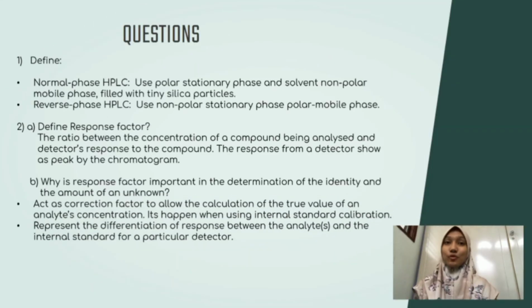There are some questionnaire and pre-lab questions regarding our experiment, high-performance liquid chromatography. Firstly, define the normal phase of HPLC: it uses a polar stationary phase and a non-polar mobile phase, filled with tiny silica particles. However, reverse phase HPLC uses a non-polar stationary phase and a polar mobile phase. Second, define the response factor: it is the ratio between the concentration of the compound being analyzed and a detector's response to the compound. The response from a detector is shown as a peak in the chromatogram.